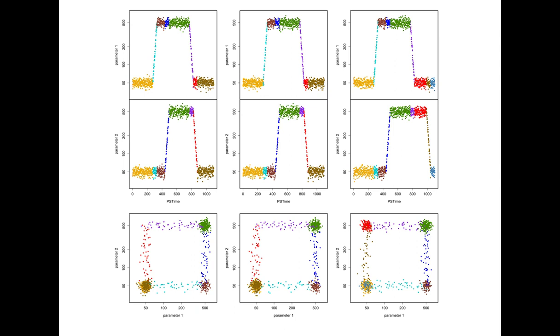The 2 parameters are correlated in time. When a proliferating population of cells is sampled, because they are asynchronous, all points along the timeline of expression are represented. Thus, if we plot parameter 1 versus parameter 2, we get 2 parameter histograms as shown in the bottom row that look like typical flow cytometry data. I've color-coded the clusters and transitions, bottom row, and their corresponding segments in the 2 top rows.